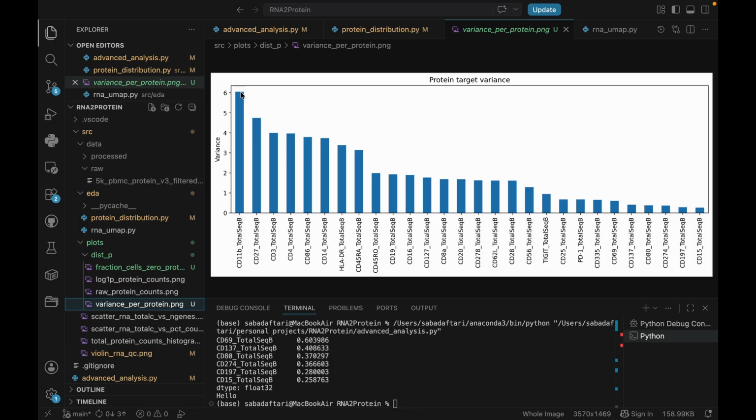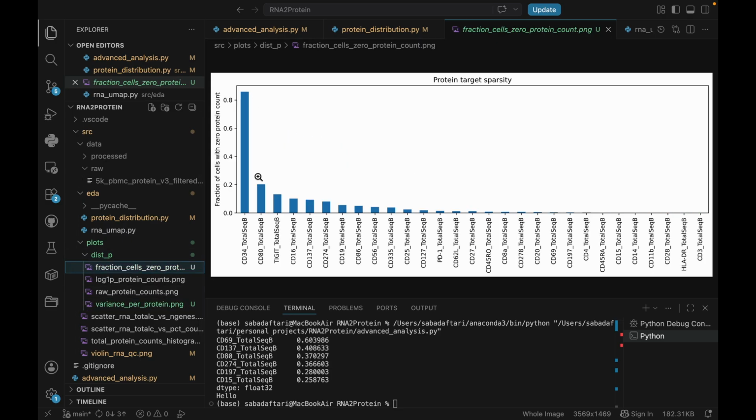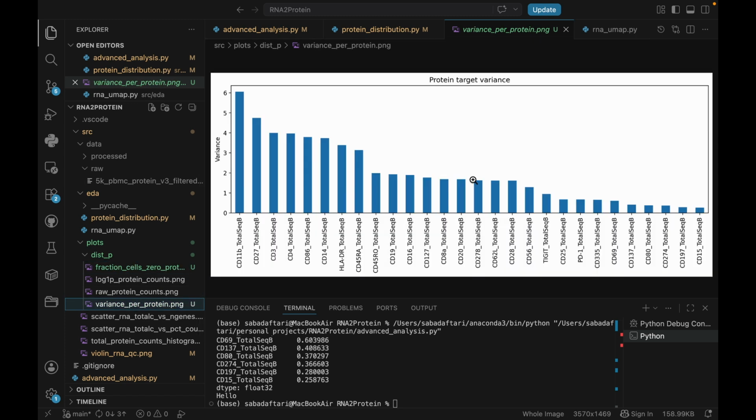There is a smooth continuous decline from left to right. I don't see any dramatic cliff or gap like the one we had before. That point would tell you where to cut, right? But we don't see any of that here. Maybe a little bit here, but still kind of continuous. But we can maybe split this into 3 tiers.